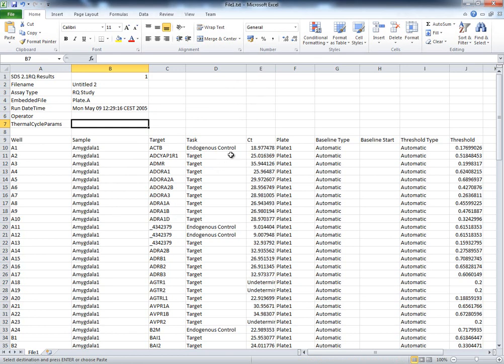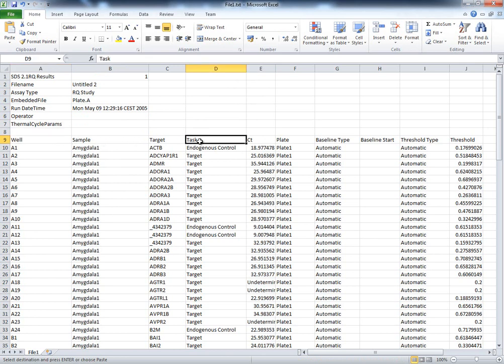Additional information related to well, task, plate, or efficiency are optional. Let's go back to the loading tool.